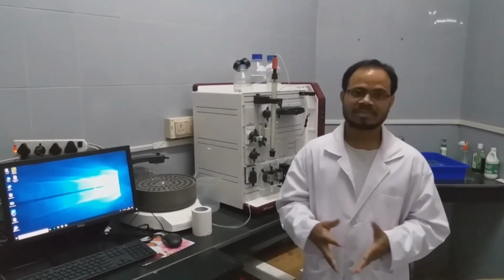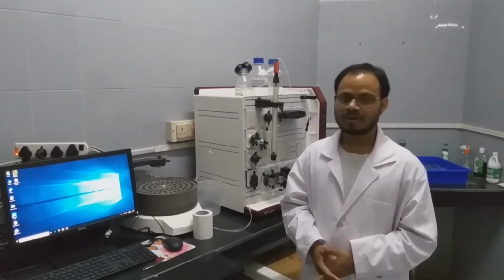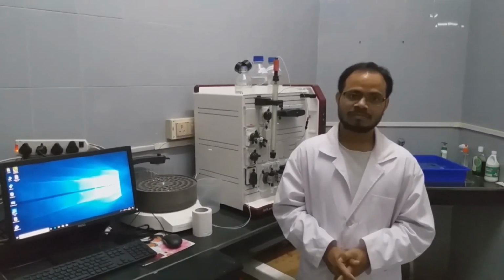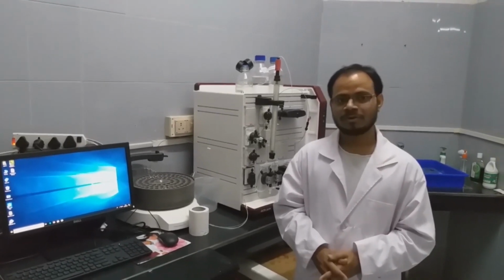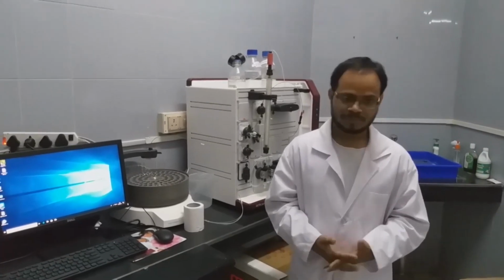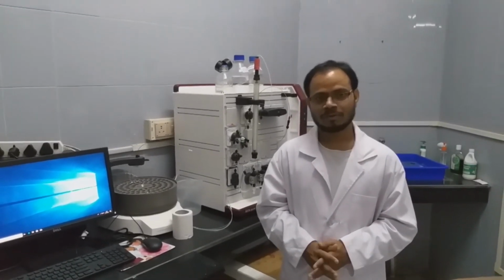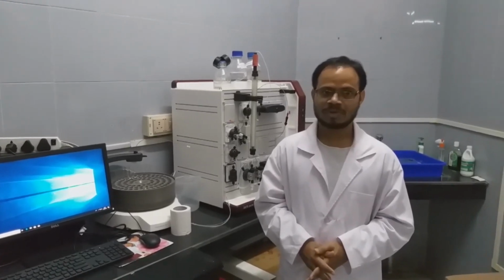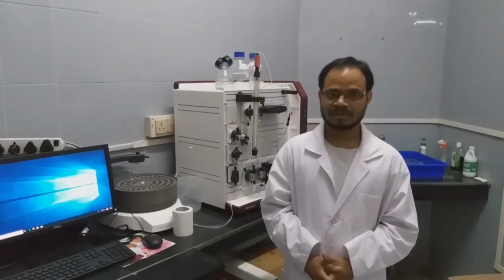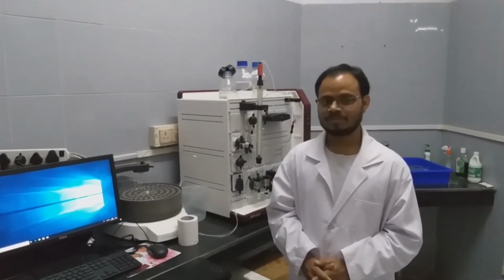It depends on what column you are using. If you want to purify histidine-tagged proteins, you can use a nickel NTA pre-packed column. Suppose you want to separate high to low molecular weight proteins, you can use any gel filtration column suitable for your protein. But the principle behind the separation is the same.